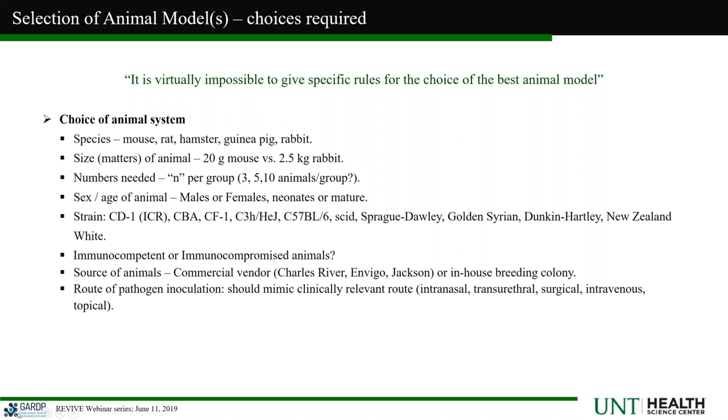If you're doing a bacterial titer endpoint where you have multiple dosing days or even multiple infection times, a good rule is the more manipulations you have to animals and the more time it takes to run the model, the more animals you should have in those types of groups. So if we're running a model where bacterial titer is an endpoint, there's multiple dosing days, and we're maybe looking at several endpoints, we like to go upwards of 10 animals for that type of study.